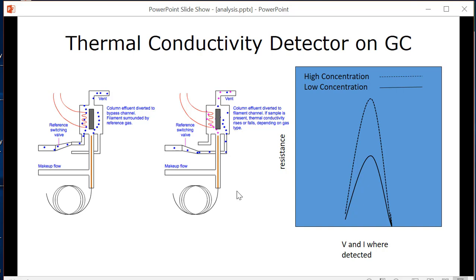So you don't know the known concentration, that's true, but you know if its responses, for example, fell between these two peaks, then I could give me a couple more peaks above and below, and I'll actually be able to prove to you in the area at which I'm analyzing the unknown, I know that this thing is linear. And that's kind of the standard: at least 3, which is not really very good, but 4 or more samples at different concentrations that bracket the response seen by the unknown will be appropriate to set up a calibration curve.